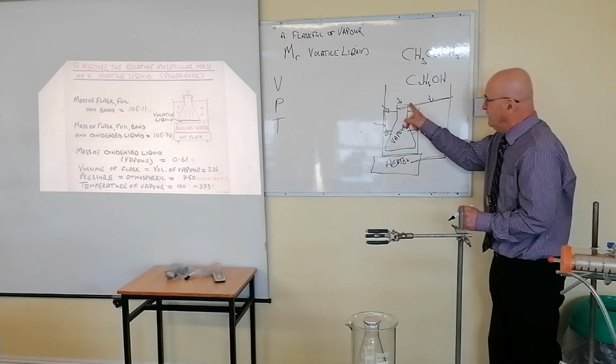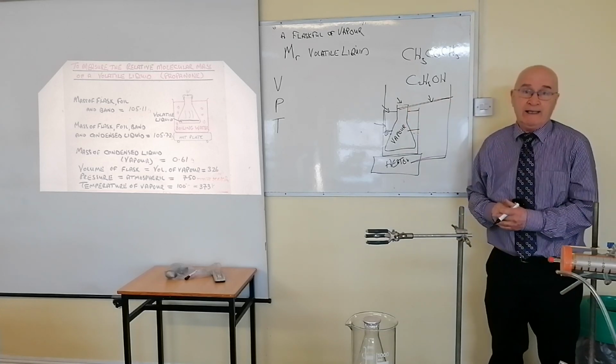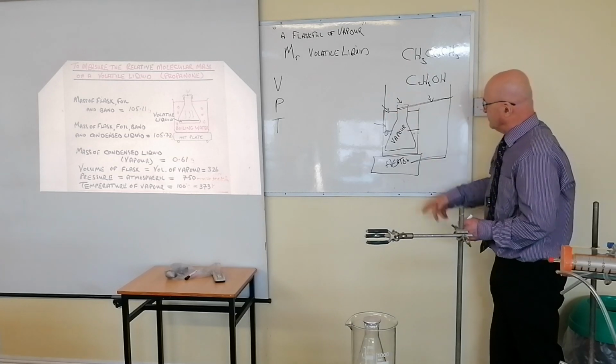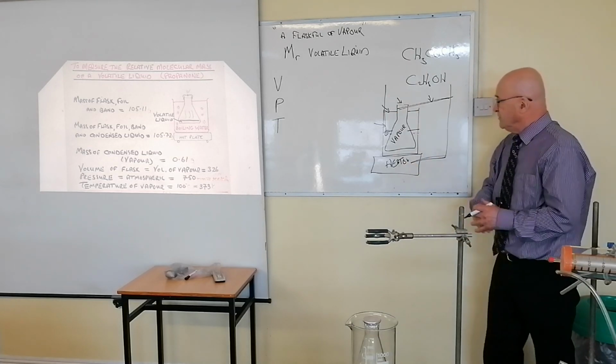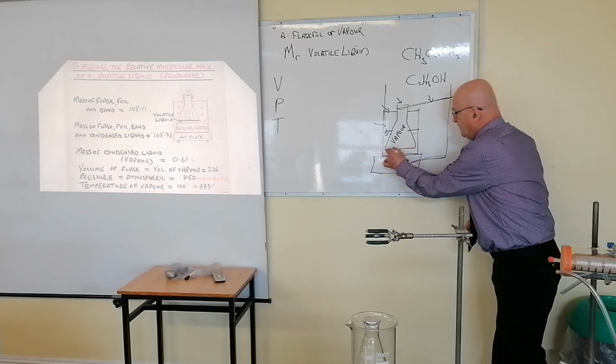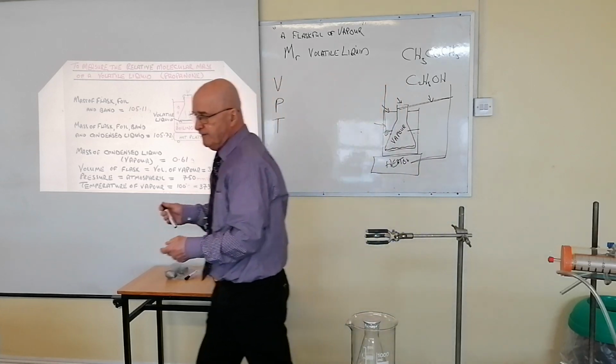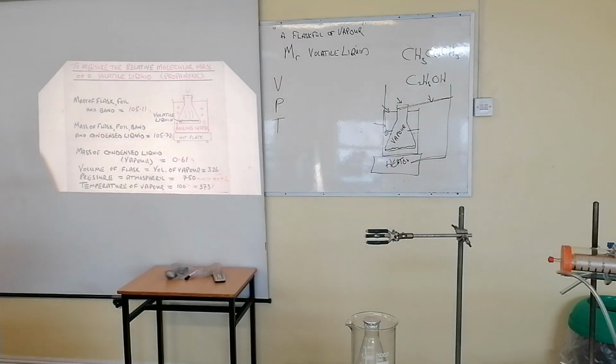That's a tin foil lid with a pinhole in it, okay? That is a retort clamp, just a clamp, call it a clamp, okay? That's a thermometer, that's boiling water, and that's your heater. Okay, and that is the vapor in there, okay? That's the volatile liquid, and you're waiting for that to disappear. Now, we're ready to look at calculations, but remember the narrative part of this is very important as well.